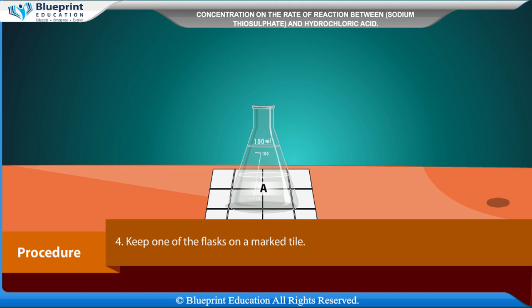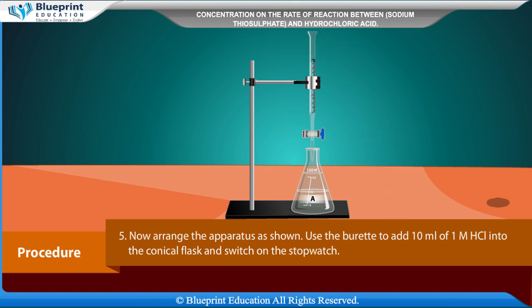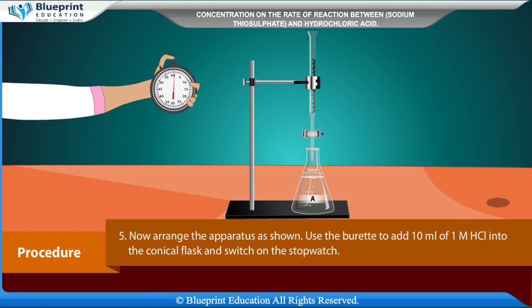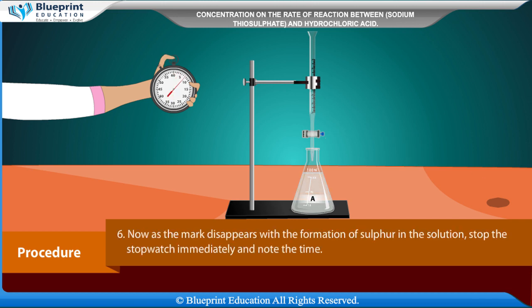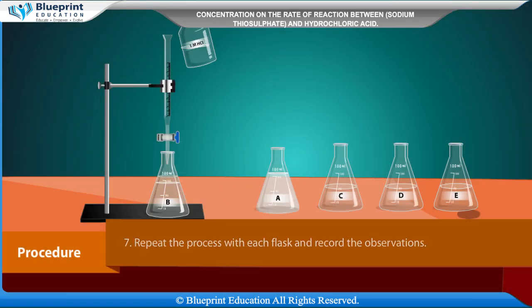Keep one of the flasks on a marked tile. Now arrange the apparatus as shown. Use the burette to add 10 ml of 1 M HCl into the conical flask and switch on the stopwatch. As the mark disappears with the formation of sulphur in the solution, stop the stopwatch immediately and note the time. Repeat the process with each flask and record the observations.